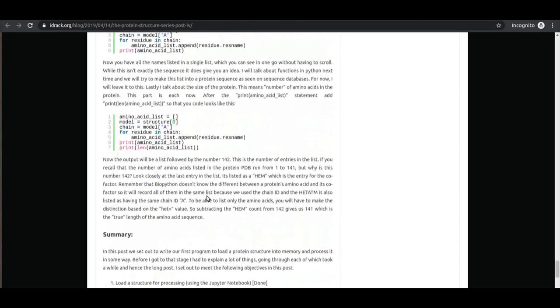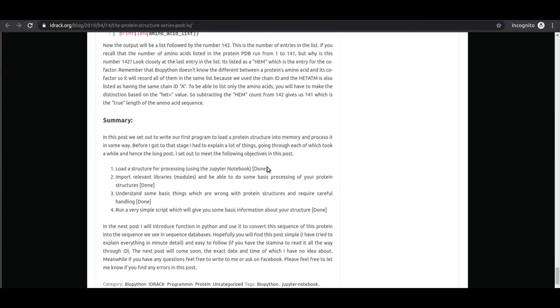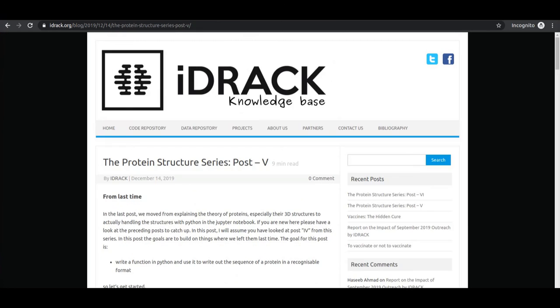The 'hello world' program loads a protein structure into your environment and extracts the sequence. As a simple exercise, seven commands from the point you load your structure are all you need to extract the protein sequence. Having done this, we realize that the protein sequence returned shows three-letter characters rather than single-letter characters — each amino acid is represented by its three-letter code.